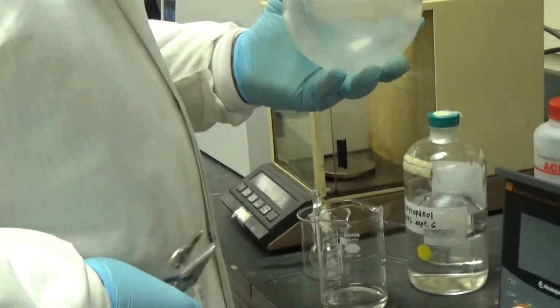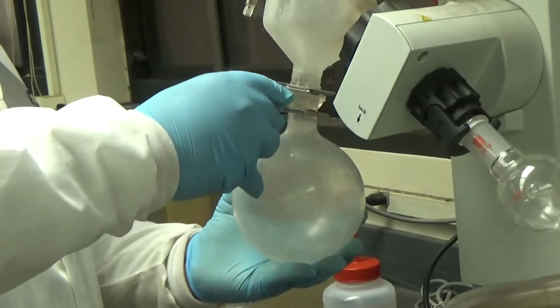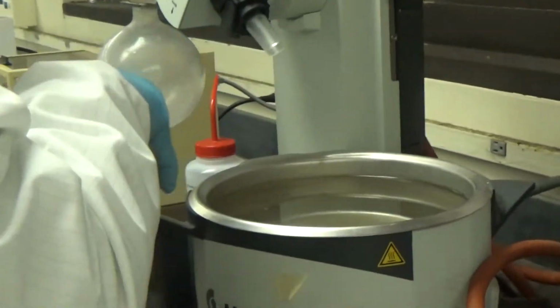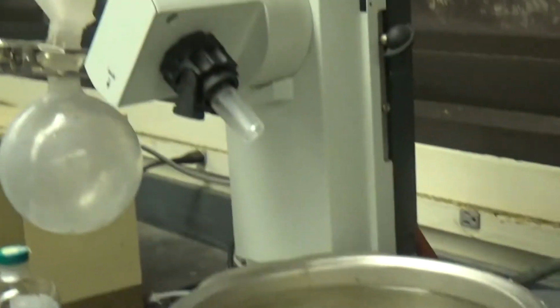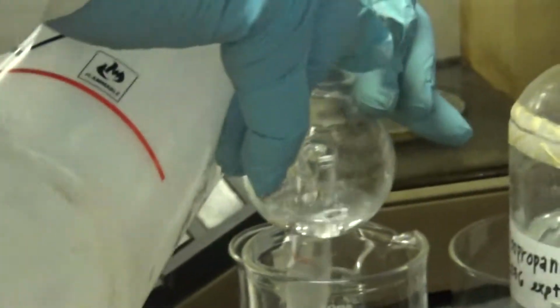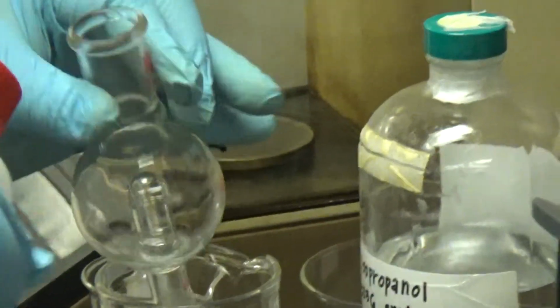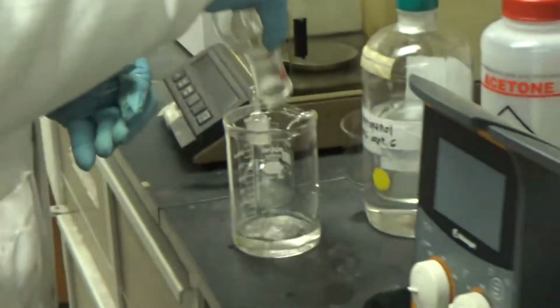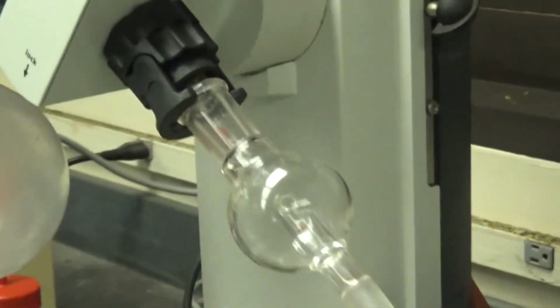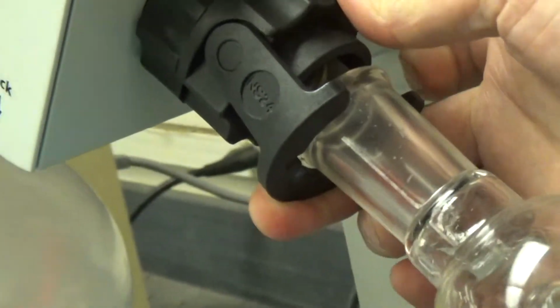Then put it back. Now you have to take off the bump trap. Rinse that with acetone, cleaning the bump trap. You do that twice. Then you put it back. And it clips in with this little thing. This thing clips and holds it on, basically. Yeah, good.